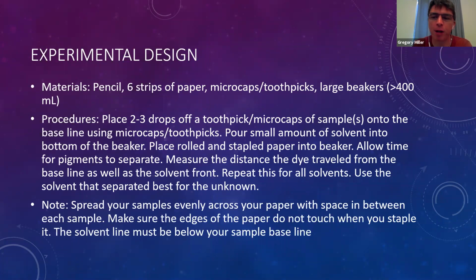First step is we will be looking at what is the best solvent, the best mobile phase for us to use. So we'll use some food coloring dyes, spot them onto the piece of paper, run them in the 3 different solvents and see which one gives us the best separations. And when you look at the pictures, it will be fairly obvious.